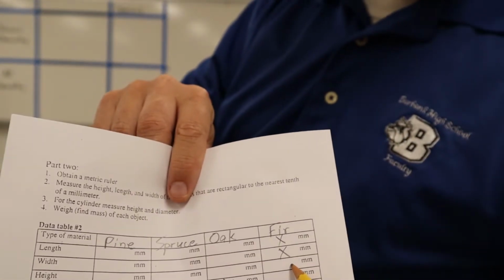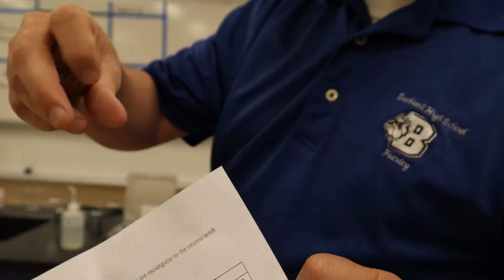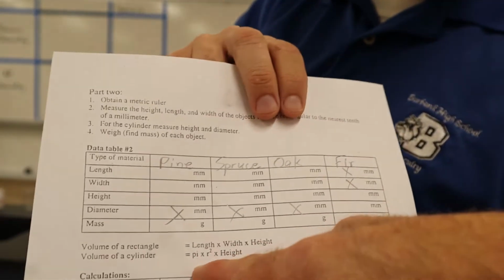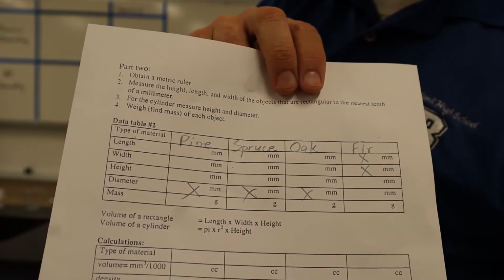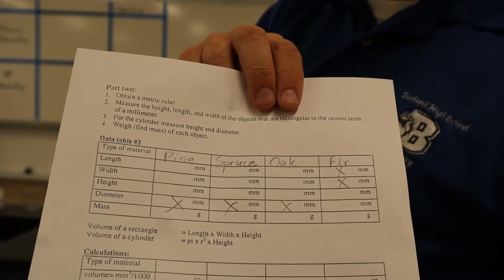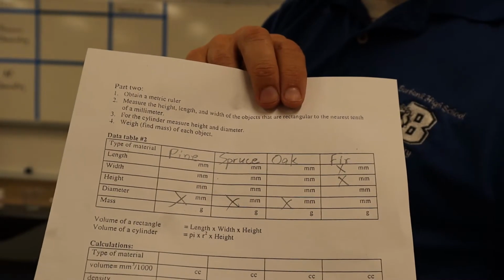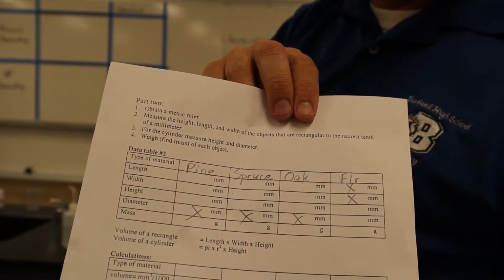We'll measure the height of the cylinder and the diameter across the top. Then we'll plug it into these equations: pi times r squared times the height is the volume. We're going to use math instead of water displacement, which gives a good example of different ways to measure masses and volumes of things.